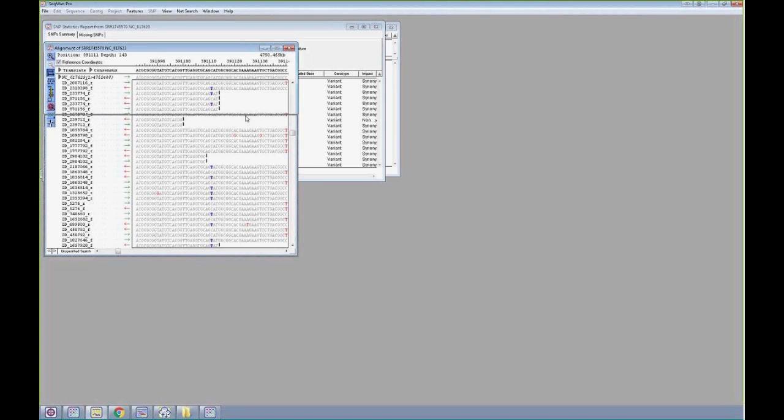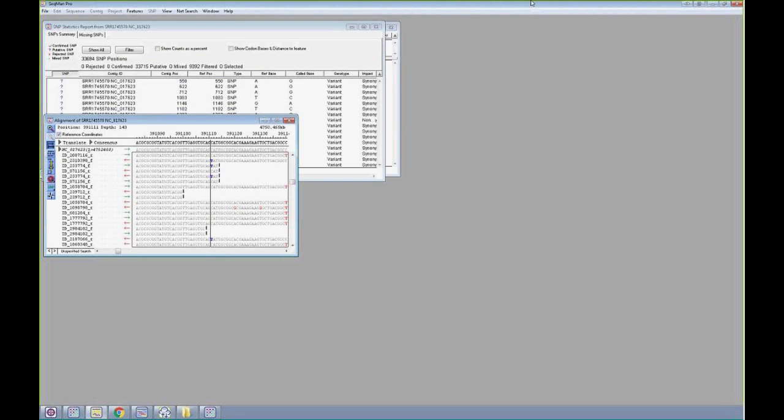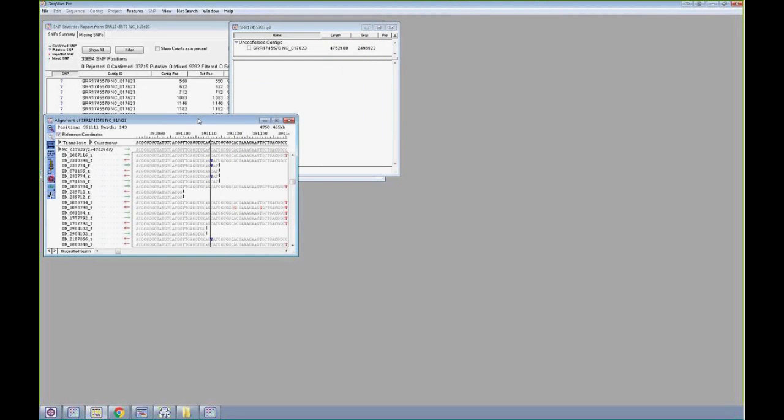You can also look at a strategy view with coverage here. I'm not going to show that today. It looks like we're running low on time, but we have some really nice new tools coming for this step in our fall release. So if you're interested in seeing more genome visualization tools, definitely stay tuned in the fall for some upcoming webinars on this part of the analysis.